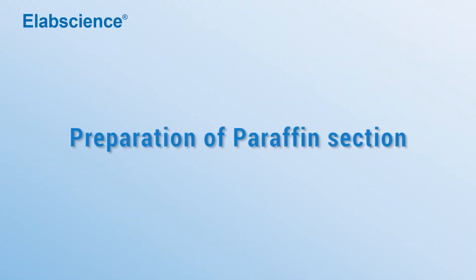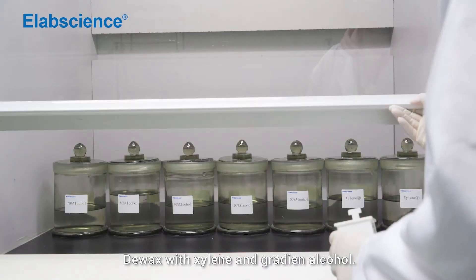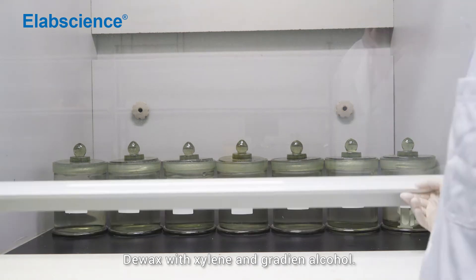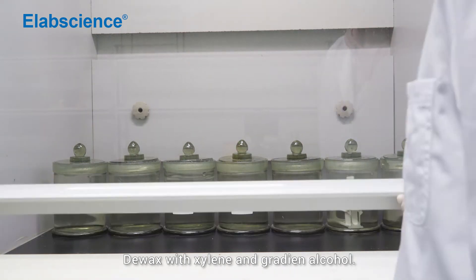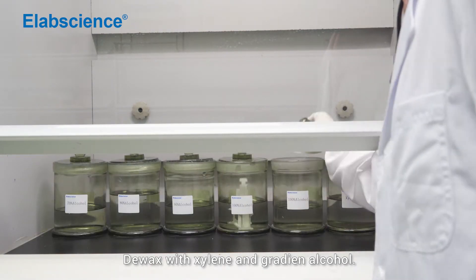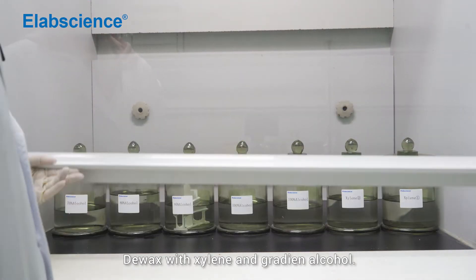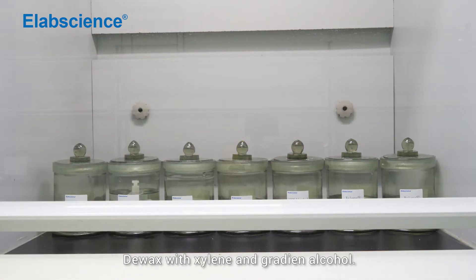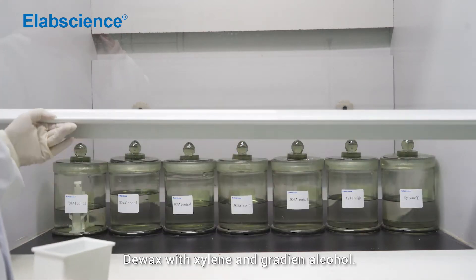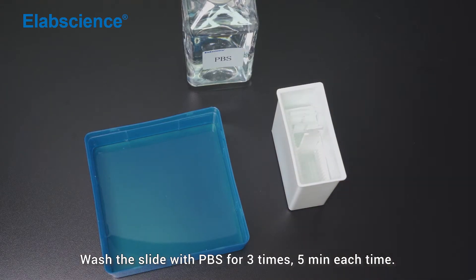Preparation of paraffin section. Prepare positive, negative, and test samples. Deparaffinize with xylene and rehydrate through gradient alcohol. Wash the slide with PBS for 3 times, 5 minutes each time.